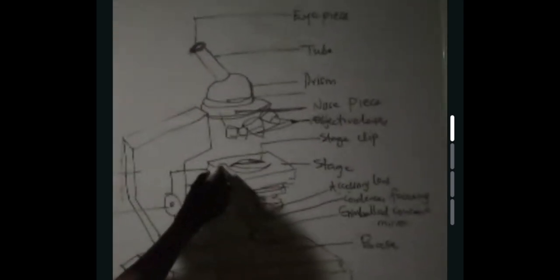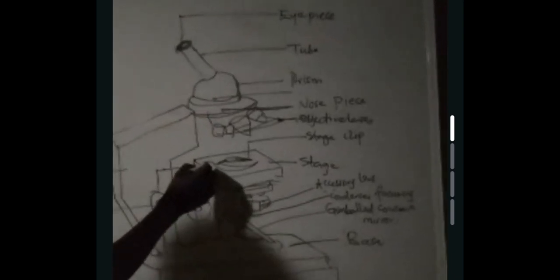This is the prism. This is the nose piece. Then there is a screw somewhere here. This is the objective lens. These are the objective lenses. This is the stage itself.